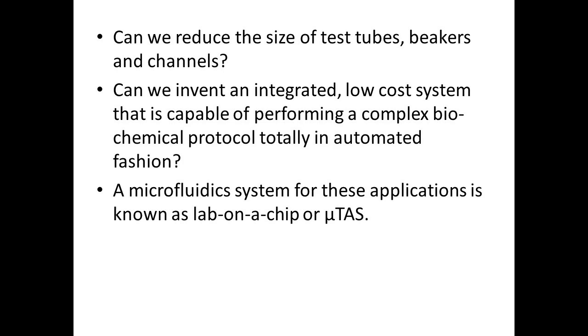If we know how the fluid behaves at the micro level, we can invent integrated low cost systems capable of performing complex biochemical protocols, maybe in an automated fashion. We can do it automatically without manually doing it.